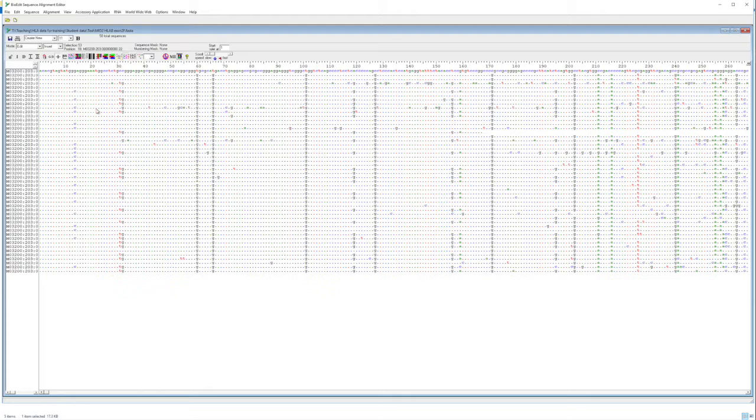Okay, the next thing that I notice is that if you remember, this primer had a mixture in it at position 3, I think it was. And that primer had an S, or a C and G mixture. But also I see mixtures occurring further across the page. I see a TG mixture here versus CC. And where there's the T and the G there, if I go across, I see that I also have a G in this position, and I have a GA in this position. And similarly, where there's TGs here, I see they have that G and that GA.